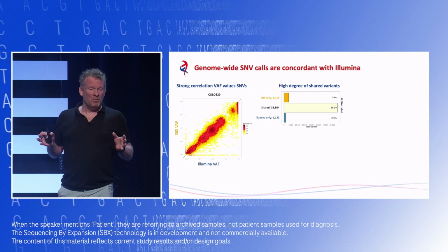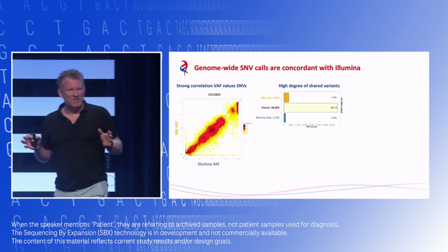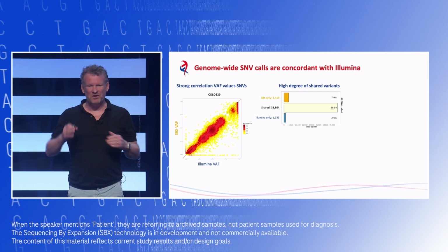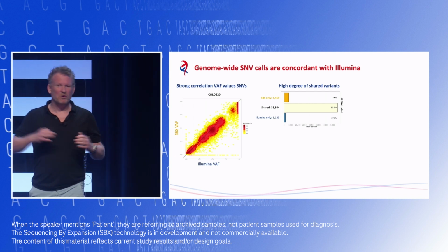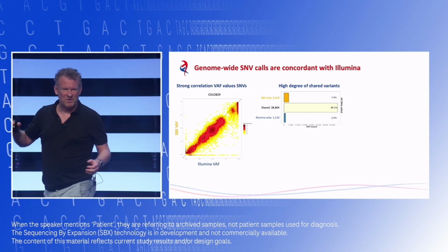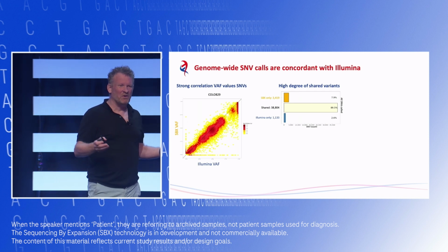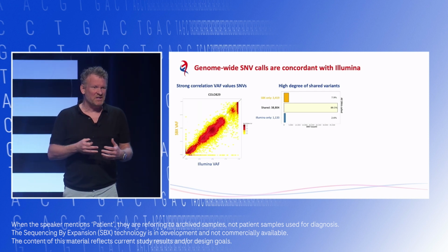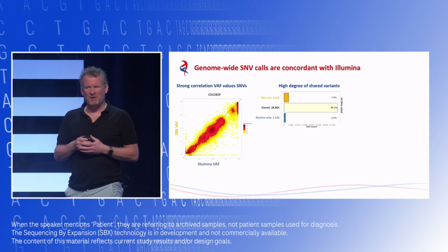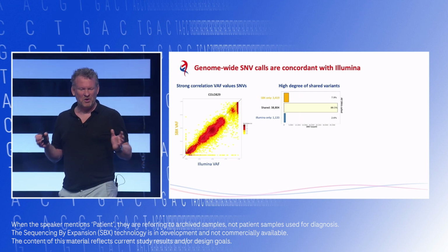This is a COLO sample, and here you see the challenge that you have with somatic variant calling. It's not a bin of 0, 50%, 100% variant allele frequency. No, it goes all over the range from 0 to 100%. At the bottom left corner of the graph, that's where noise starts meeting real signals. Actually, it's mixing. It's not even meeting each other. It's a mixed part of signals. So it's difficult to interpret these graphs.